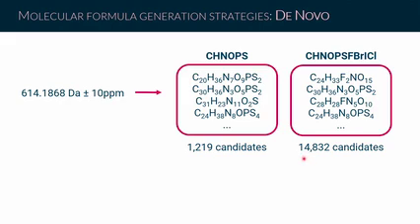So that can be quite computationally intense. That's also why it's not a good idea to just enable all elements you know and start a computation. To help you a bit with this, in SIRIUS you also have some auto-detection functionality that tries to detect which elements are likely present in a given MS/MS spectrum. Usually you just take the auto detection, but obviously there are a few elements that are very hard to detect, which are usually the elements that do not have a very significant isotope pattern.